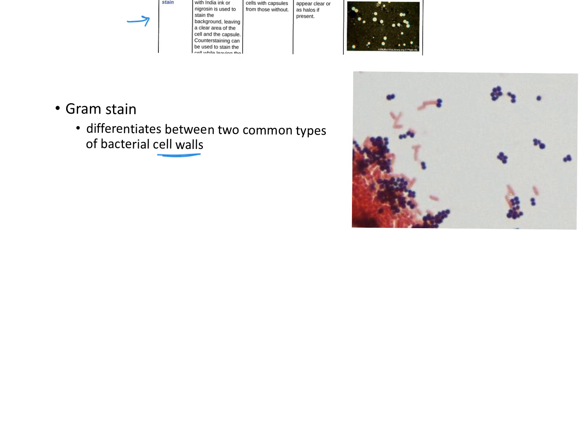So basically, I'm not going to go through the gram stain in lecture. I'm going to make you learn that for lab if you're in lab. But it's a series of different stains. If the cell has a certain kind of cell wall that retains those stains really well, that first dye that we add to it is purple, and it holds on to that and is not decolorized very easily. Okay, so that purple cell is a gram-positive cell. The gram-negative cells have a different kind of cell wall that gets decolorized very easily, so it takes up, depending on how you count it, the second or the third dye that we use, the counterstain, and that's going to be a gram-negative cell. So you'll be doing lots of that.